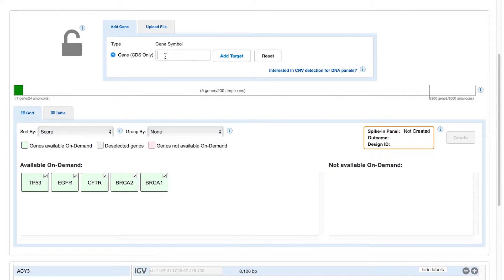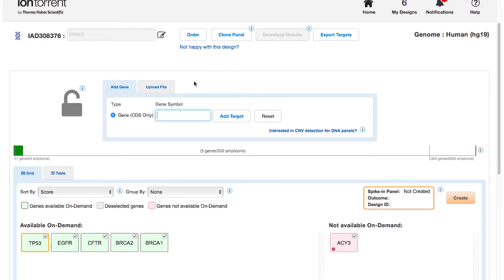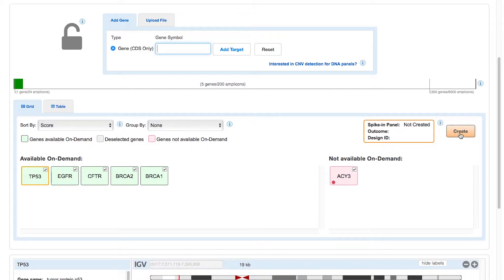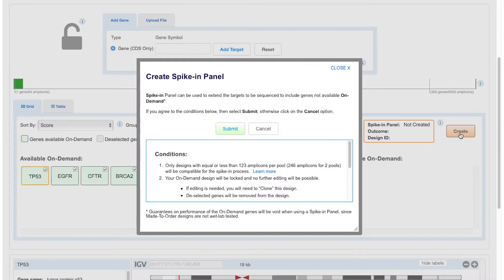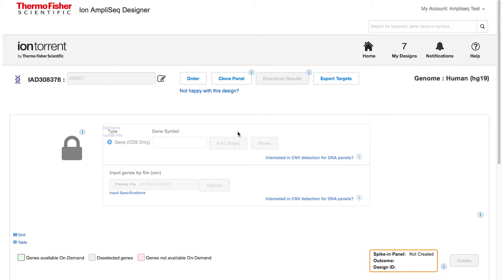Let's say you're interested in the ACY3 gene which is not yet available in inventory. You can either proceed to order a panel only with the genes that are available on demand by clicking order, or you can create a spike-in panel to target all of the genes in your list by launching the spike-in panel task. This will create made-to-order oligos containing the additional genes that are not available on demand. This feature allows you to sequence all of these genes together in Torrent Suite software to recognize the combined panel as one complete design for analysis.